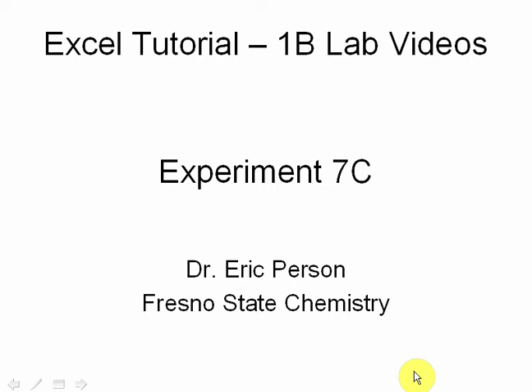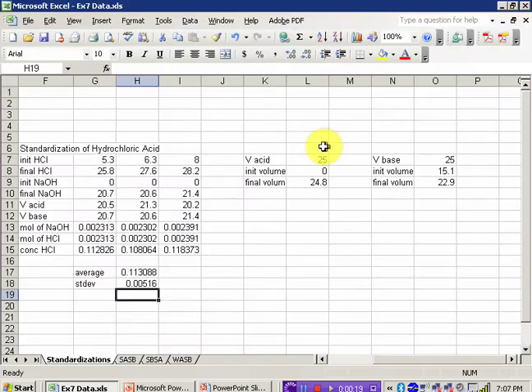Hello, in this Excel tutorial video for Chem 1B, we'll be looking at the next part of the Experiment 7 data workup, mainly the standardization of the weak acid and weak base solutions. I've gone ahead and I've entered the data in. We just finished up our standardization of hydrochloric acid, and before that the standardization of hydroxide. And the calculations here are going to be very similar.